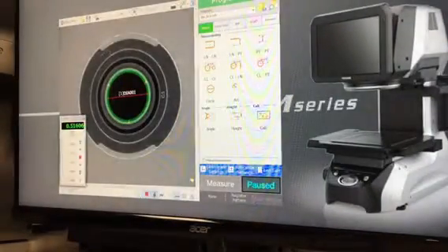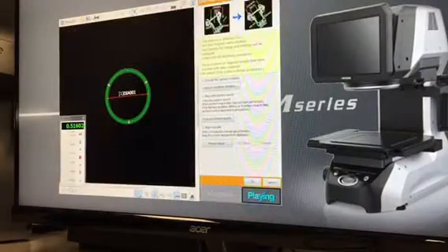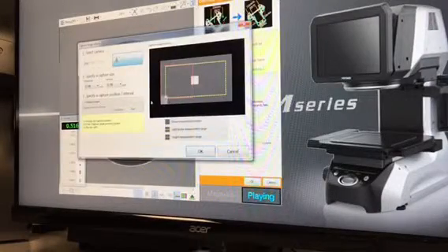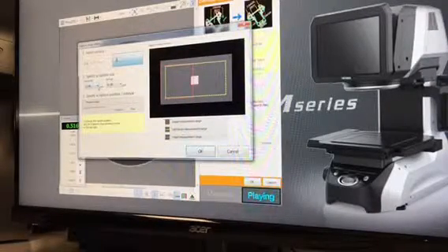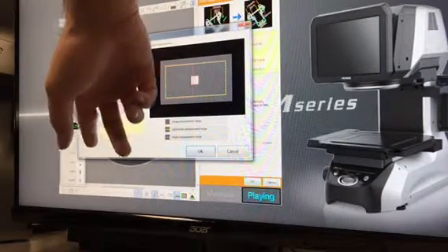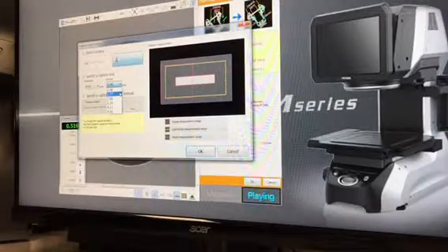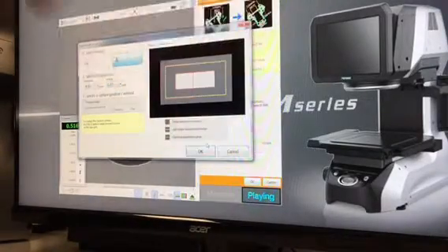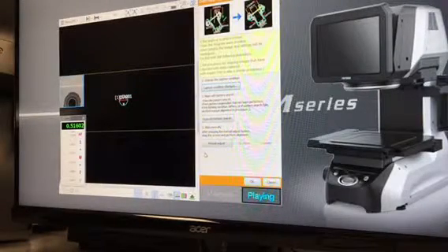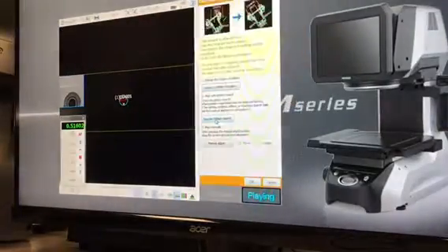So first I reestablish. So hit this. Play. Yeah. And then do capturing condition changes. Right. And then I would just do, we'll do a small program for right now, just so you understand. Do that, and then give it one more extra vertical strip. Yep. Hit OK. Oh, okay. And then hit execute pattern search.